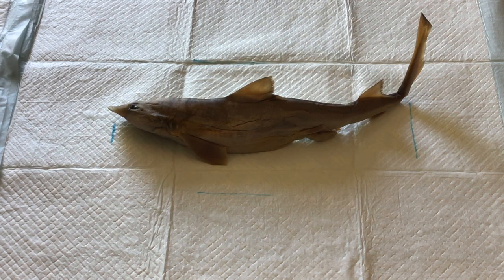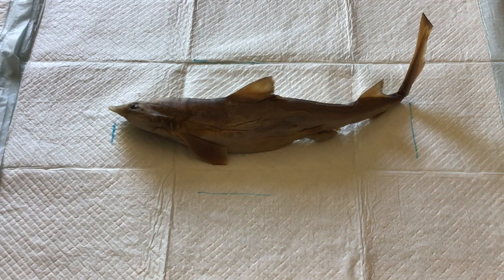They are typically gray with white spots, and that's going to be kind of hard to see on our shark here, but we're going to try. I'll try to zoom in certain places so you can see that. The sharks can also be found in black, brown, or white, but the most common is gray. They can be quite aggressive, and defend themselves using poisonous spines. And I will point one of those out to you, if they are visible.